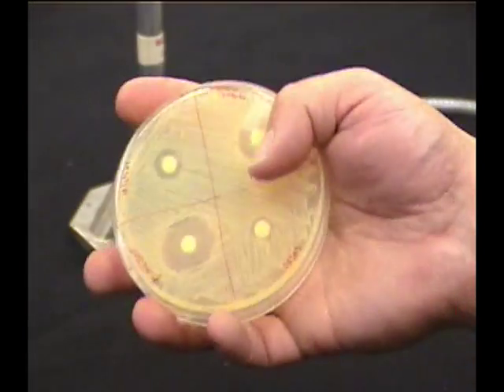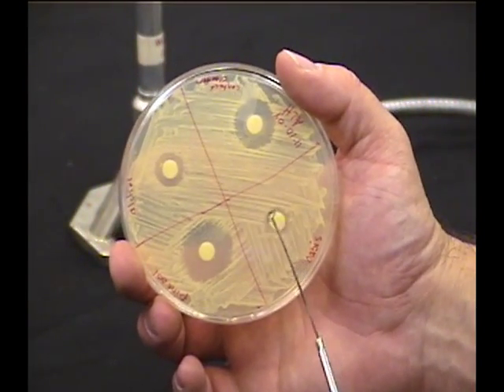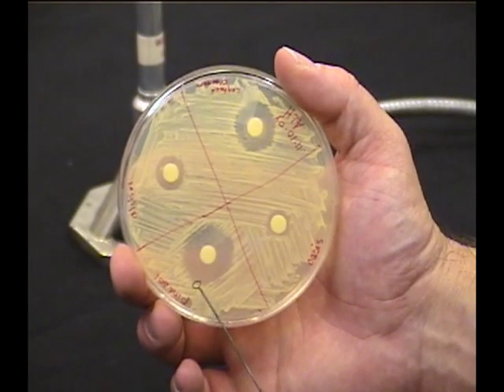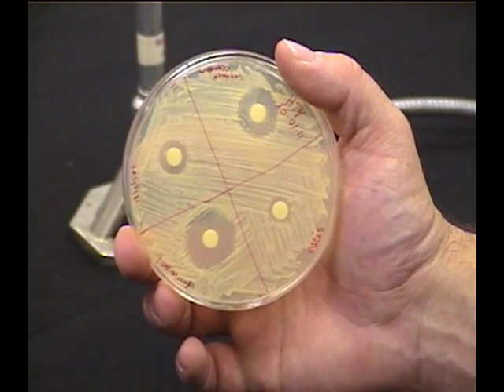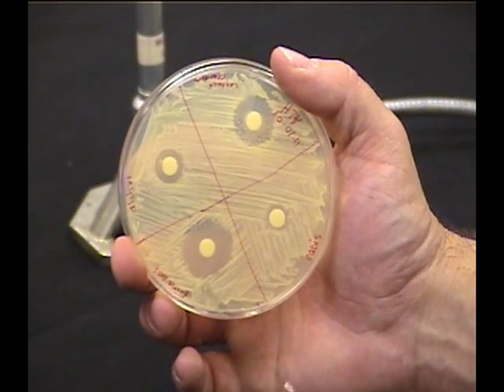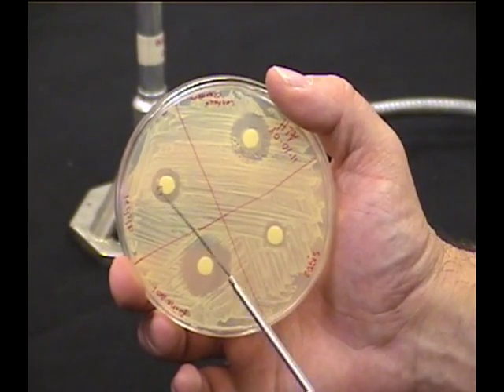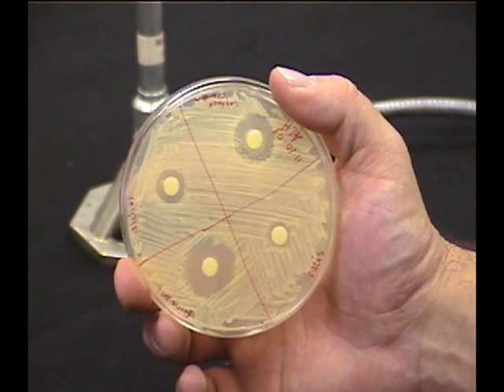We'll see a different version here, where like Oasis works a little bit on this organism, but not as much. Pinesol works probably about the same, maybe even a little better on this organism than it did on the other one. Alcohol, which worked really well on the thumb, didn't seem to work hardly at all on this. Interesting, huh?